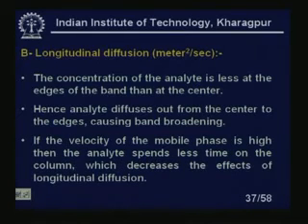If the velocity of the mobile phase is high, then the analyte spends less time on the column, which decreases the effects of the longitudinal diffusion.